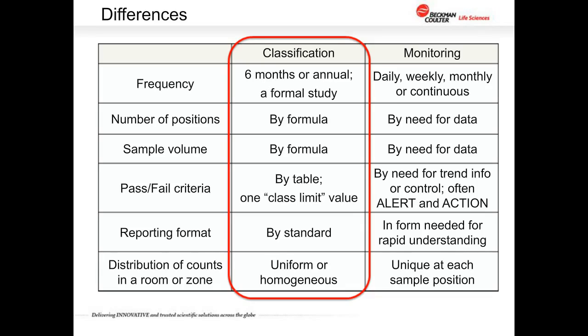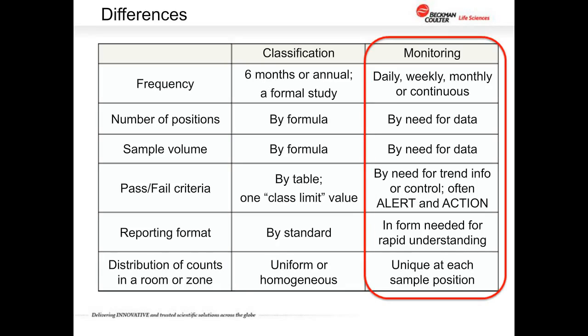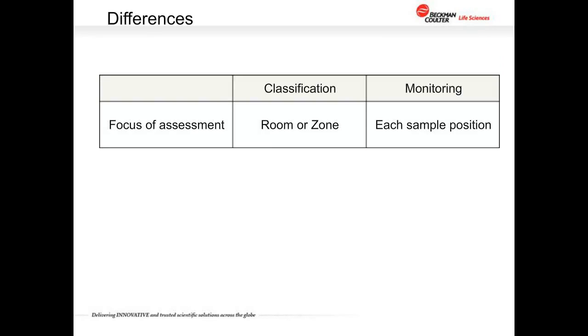So classification and monitoring are 2 distinct approaches to looking at concentrations in the air. Again, when we look at classification, the room and zone, as we'll see in this closer look at the standard, is the focus. With monitoring, each sample position becomes the focus of the assessment.